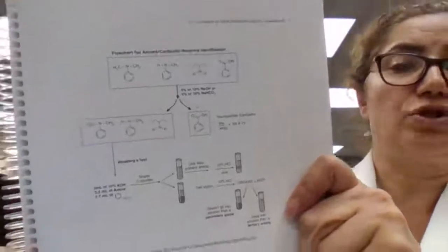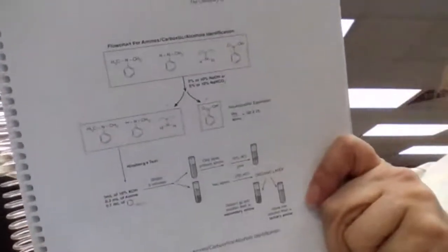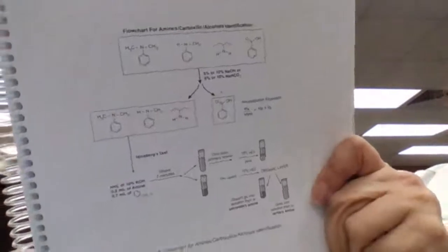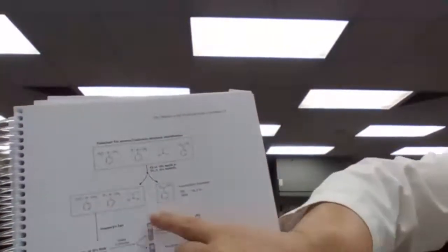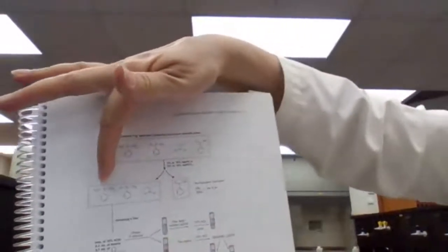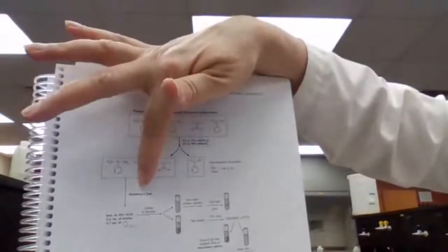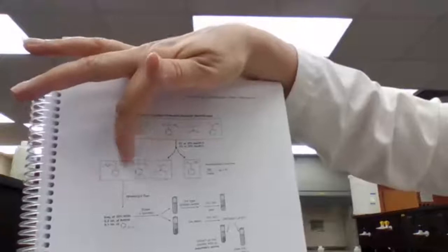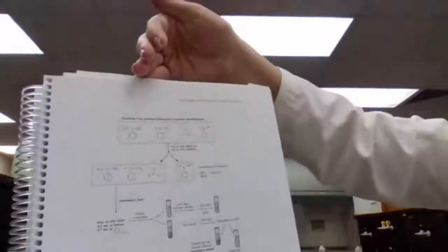I want you to bring the chart on page 219 hard copy or 217 ebook and look at the chart with me. Okay, if based on the solubility you decide that your compound is amine, it can be a primary amine, a secondary amine, or a tertiary amine. Then, using the Hinsberg test, you can identify whether it is primary amine, secondary, or tertiary, because that's what we are trying to find out.